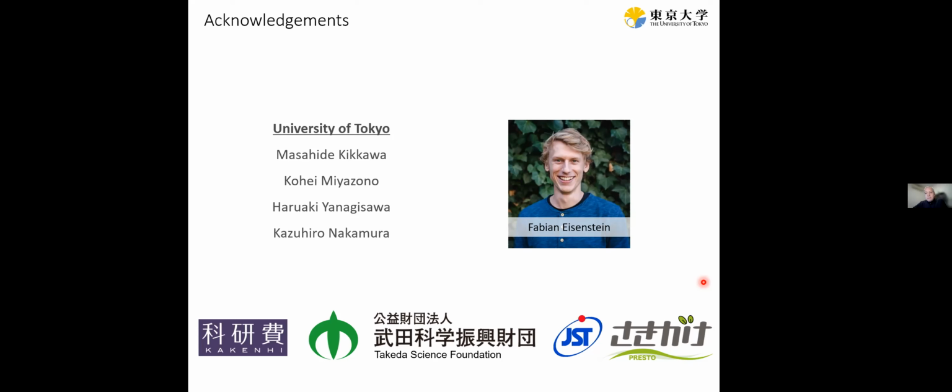You should probably ask Patrick about this if they pre-screen, but in a sense, I think there was also motion analysis. I don't remember all the details, sorry. But just from the cryo-EM data and the dynamics, after processing of the data, I think the nanobody definitely stabilized and made it more rigid. About the biochemistry, maybe Patrick could chime in. Okay, sure. Thanks.